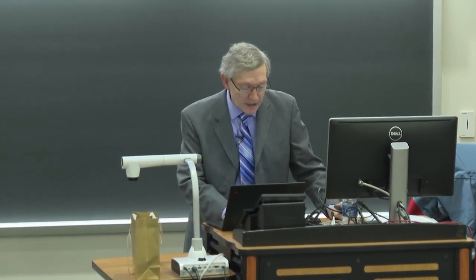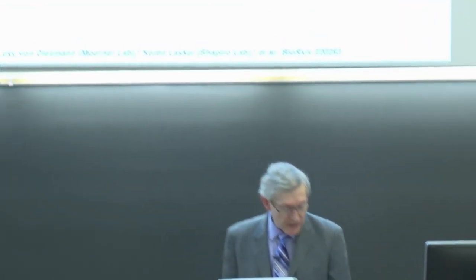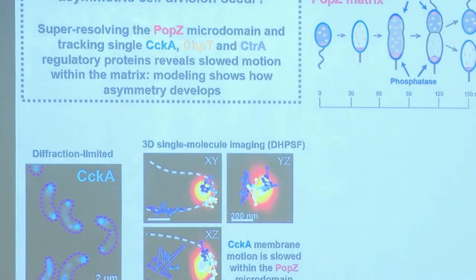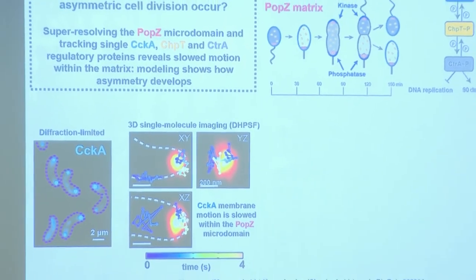What happened here? Where did it go? I had it for a moment. We should be able to see this if I'm able to turn it on. These are live cells, and they're the bacterial cells again. And there's a specific protein that's been labeled that's part of a regulatory pathway. So all the details I'll leave out.